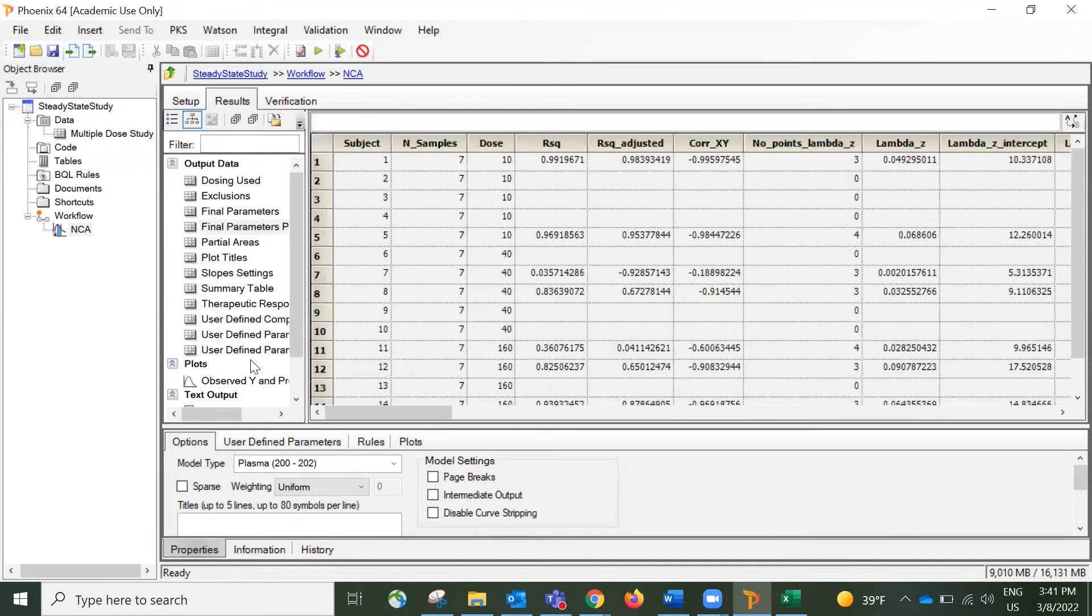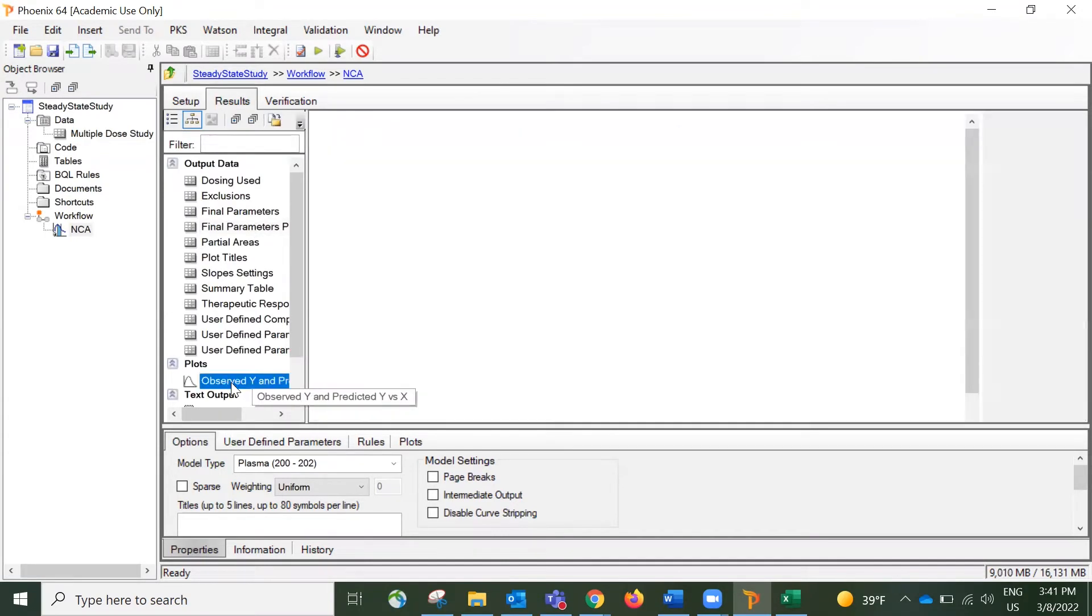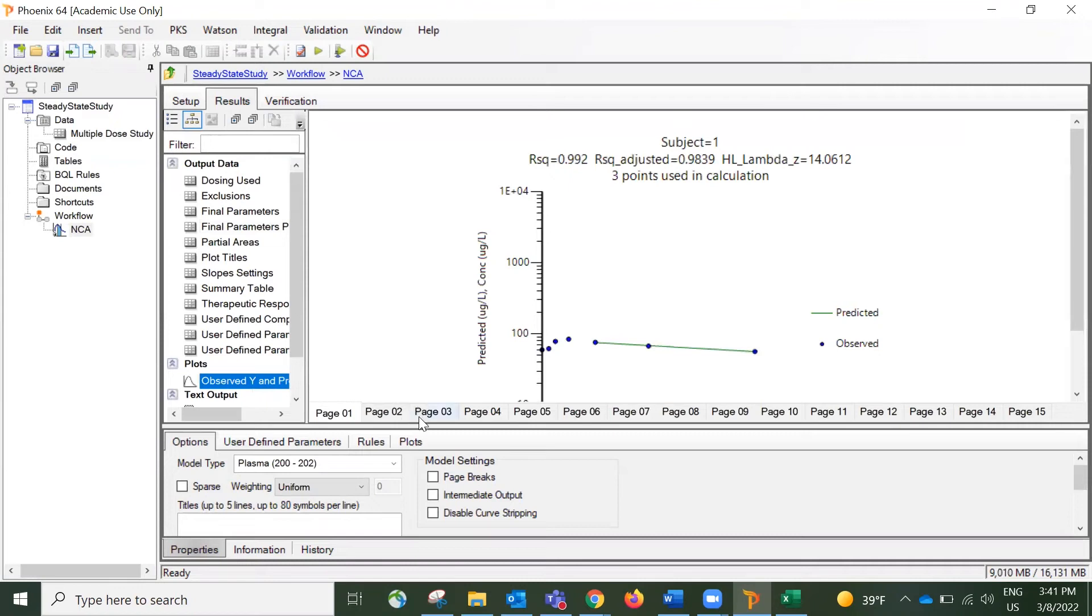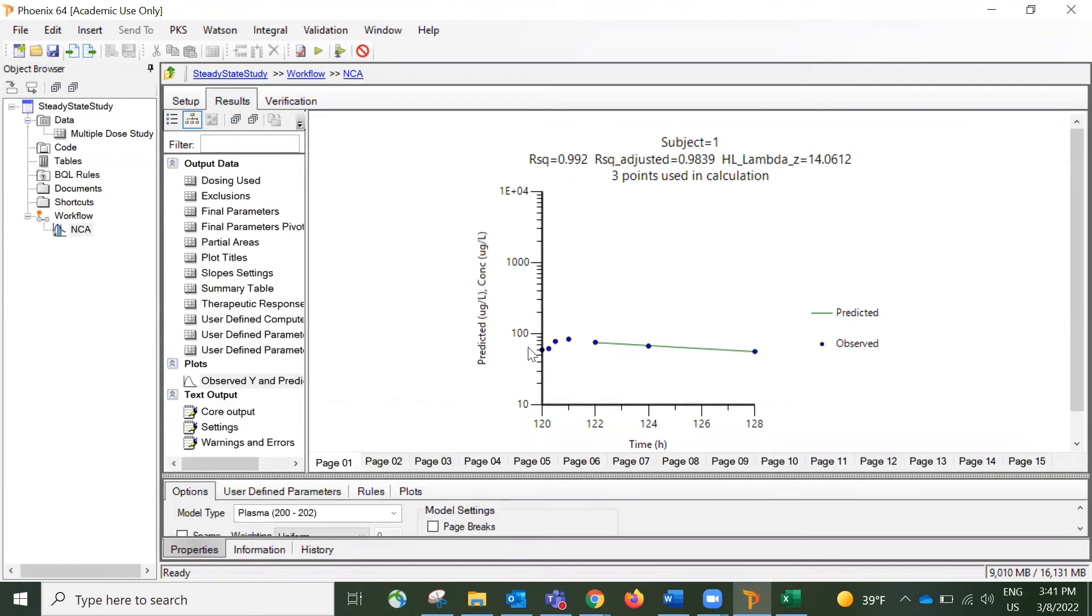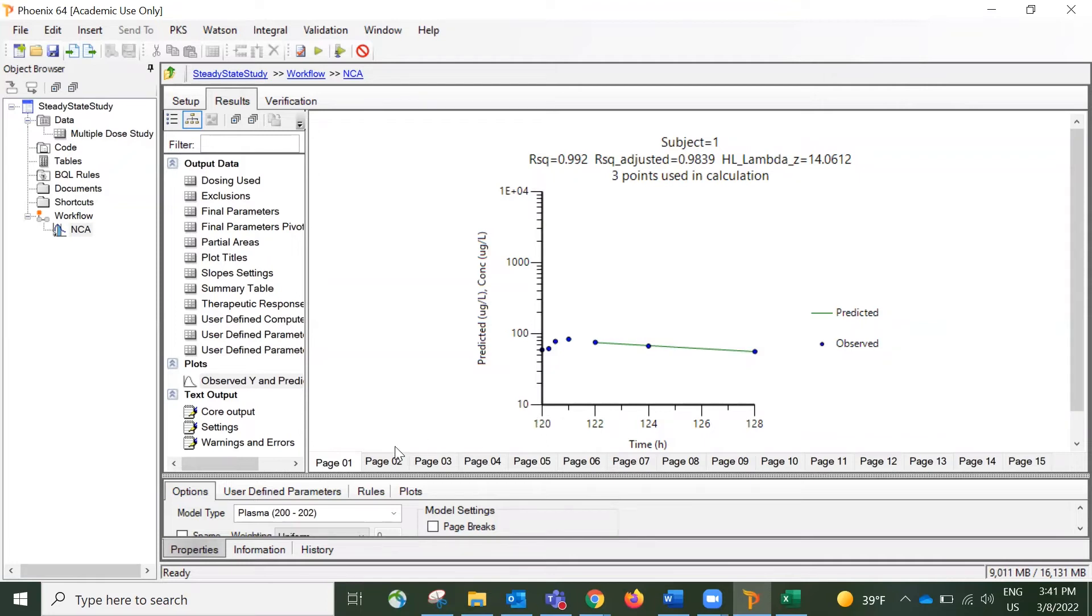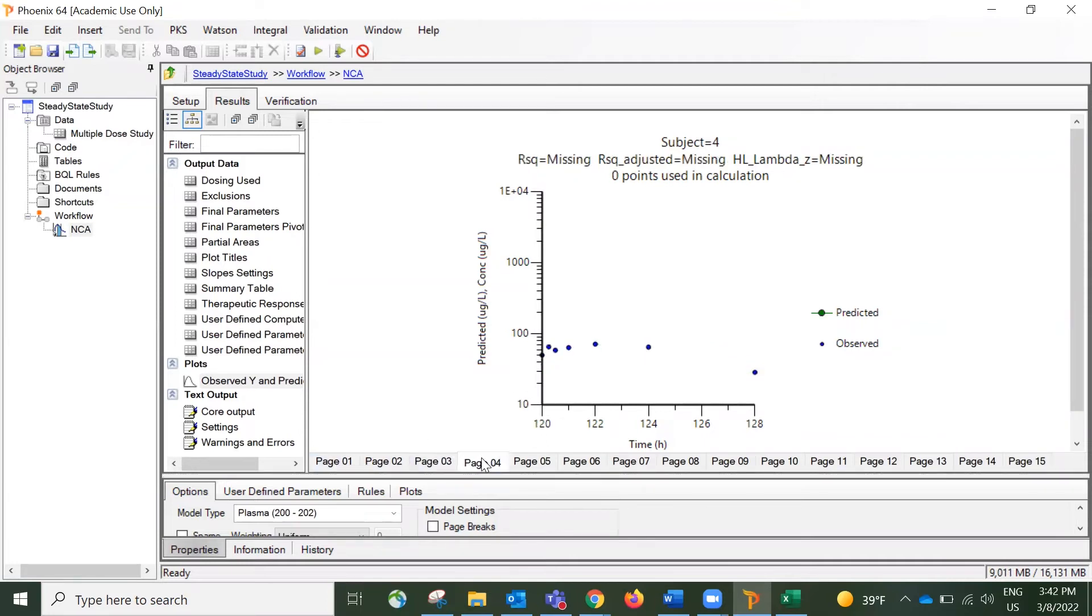So let's go to the results tab to take a look at the results. Let's first take a look at the plots in here. We can tell that from this plot, the x-axis starting point is 120 hours. And it's the same thing for other objects as well.